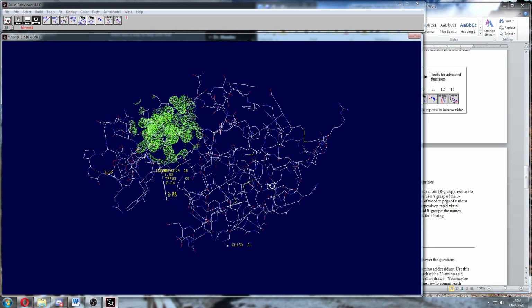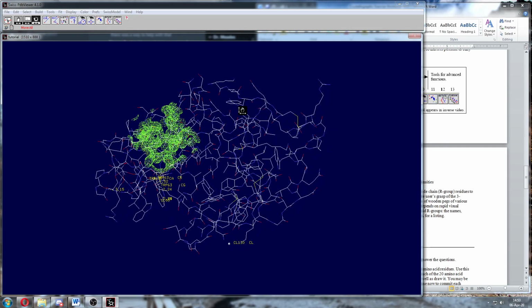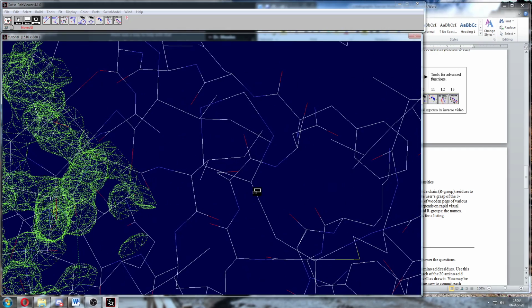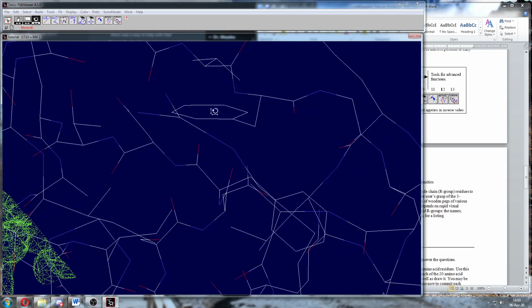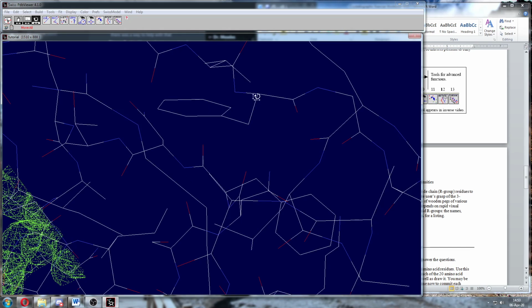And so I want you to find every amino acid in the structure. I want you to do it one of two ways. One way, do it like this. Go in, zoom in on any one you want, and say, what is that? I'm just going to pick one. What is that amino acid? Right? Based on what I see, I think it is alpha carbon, beta carbon, and then a benzene ring. That looks like phenylalanine. So I'm going to label it. I'm right, it's phenylalanine. Right?